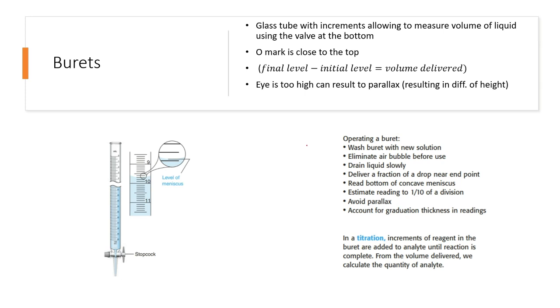When operating a buret, wash it with new solution - it depends each time. Make sure the air bubble is eliminated before you use it. Drain the liquid slowly. This is very important: deliver a fraction of a drop near the endpoint. Because endpoint, as you'll learn in titration, is when important changes take place. In general, you should develop a habit of delivering tiny bits, not right away, because you're going to miss the endpoint. That's one thing you should never miss when doing titration.